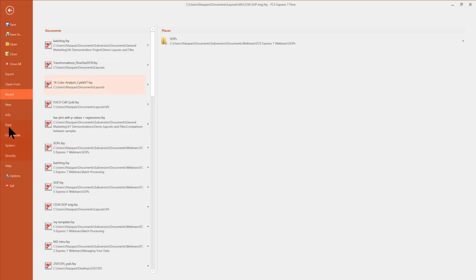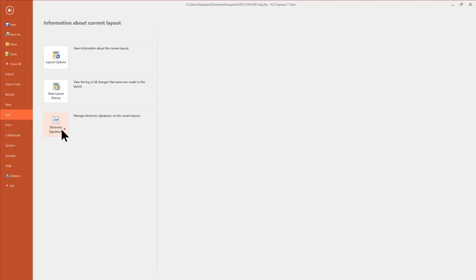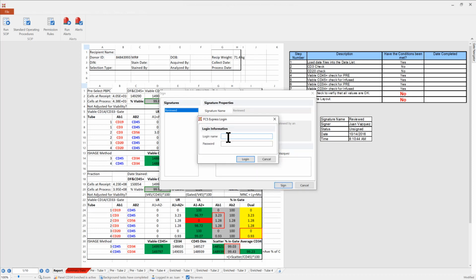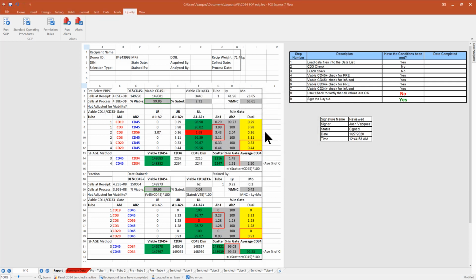But let's say I want to sign this now. I'll just select the signature that I want to use with this. And now it's signed.